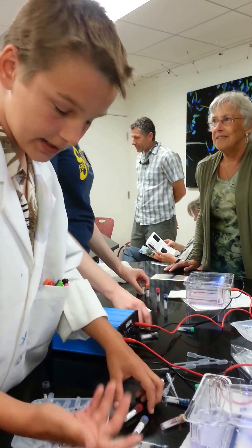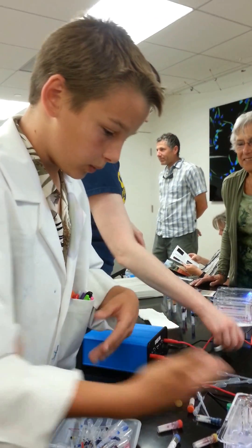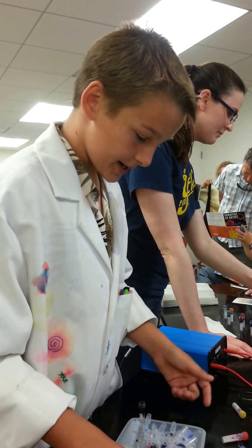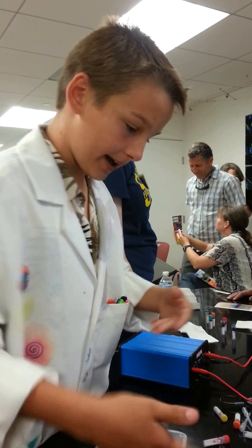These dyes aren't toxic, and the solution in there is just a salt water solution. When they finish the empty pipette, they put it in here and get a new clean pipette, and they do it however they want.